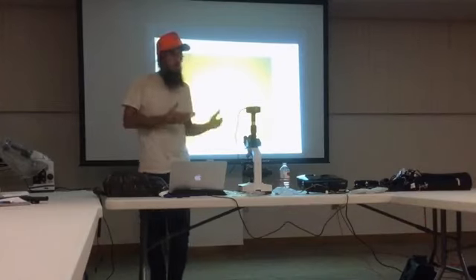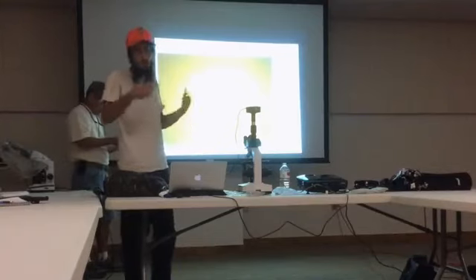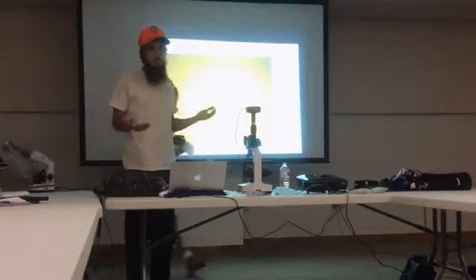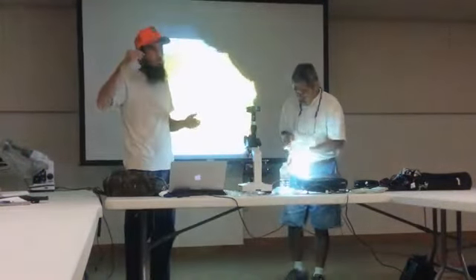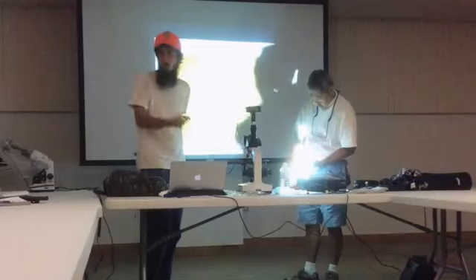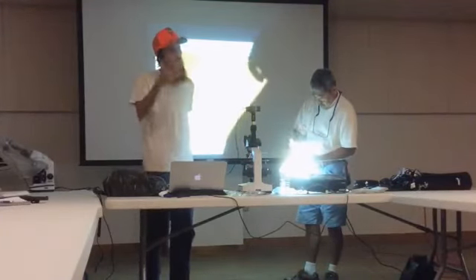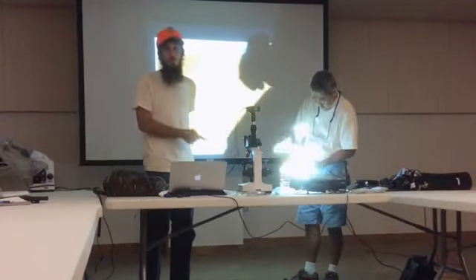Because before that, I'd been like, you make up an IMO4 pile or you make your IMOs and, is it good, is it not? So this tool right here and understanding the beneficial fungus gives you a real quick way to save time, money, energy, all that. And especially when I'm doing compost teas and brewing things, I like to look at the organisms before I use them.